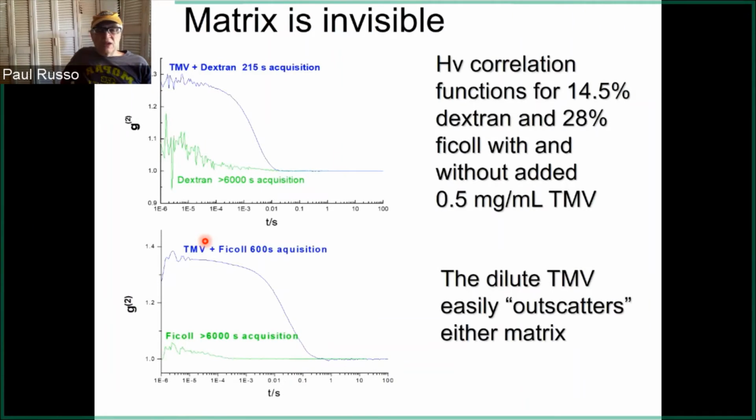And this is what the actual signals look like in the correlation function. I think probably only Luke has done this experiment a little bit in the labs. But anyway, the point is that we've added this other stuff. Dextran polymers have been added to try to slow the virus down, and we're questioning, how much does it slow down and stuff like that. That's the kind of thing we were studying.